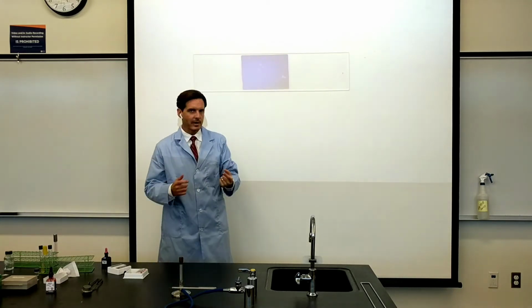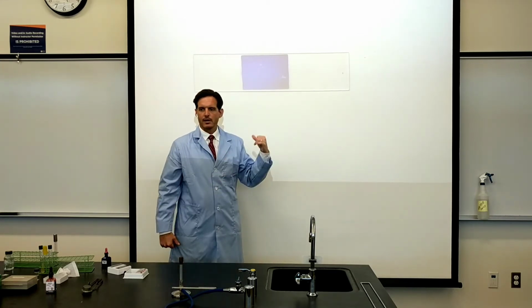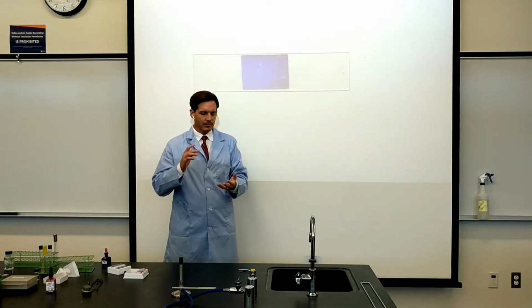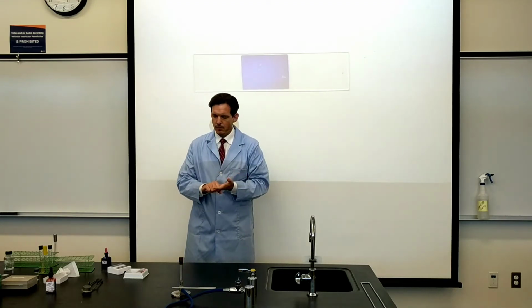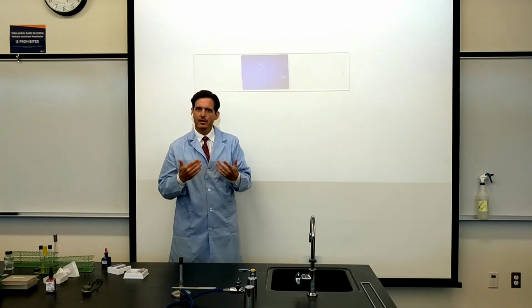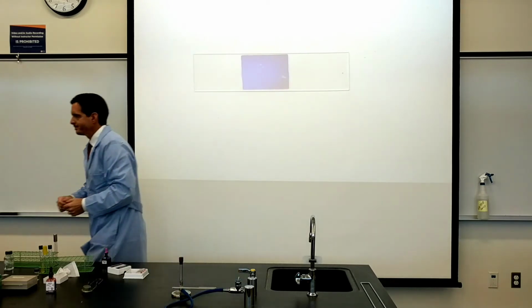So I'll get the microscope out, and the next thing you guys are going to be seeing is a view of the cheek cells at various magnifications. We'll start with 4x, and then we'll go up to 10, 40, and we're even going to do oil immersion, which is the last part of our lesson in microscopy and how to use the microscope.